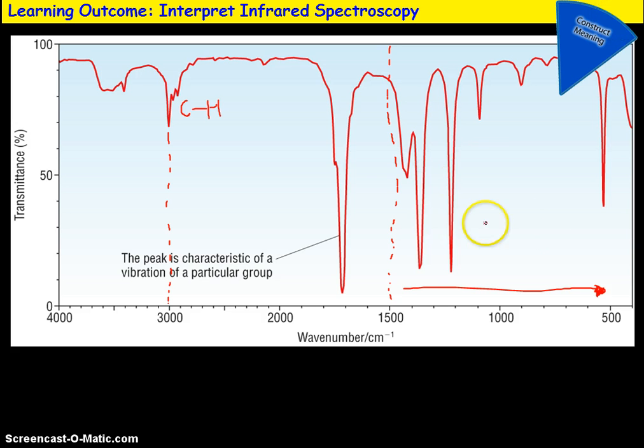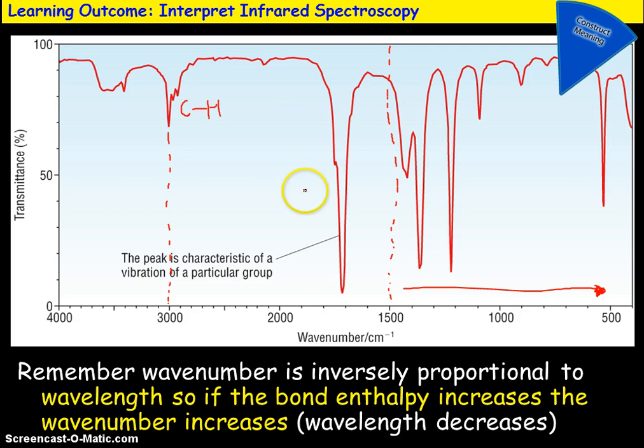Now, one of the peaks down here will also correspond to a CH vibration, but rather than being a CH stretch, it would be a CH bend. And we're not interested in trying to identify what each one of these peaks is. The only reason we use it is to clearly identify a chemical when we know what it is, so we can compare the fingerprint region. So we're interested just in values higher than that. So this has a key peak at just about 1,700. So that will correspond to a C double bond O, so a carbonyl group.